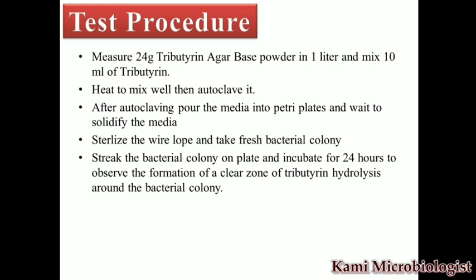After that, when the media gets solidified, what will we do? We take the wire loop and sterilize it. After that we will take the bacterial colony and streak it onto this media. Now after 24-hour, 48-hour or 72-hour incubation, we have to check for the clear zone of tributyrin hydrolysis around the bacterial colony. This is how the test procedure goes.